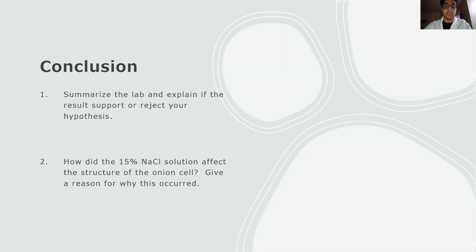And if you're seeing this video, it means you're somewhat interested in biology. If you're interested in learning more, I highly recommend that you go out to your nearest library and rent a microscope and run this experiment at home, carefully, obviously. Run it with different pigmented vegetables or fruits, and see how these different solutions affect them.